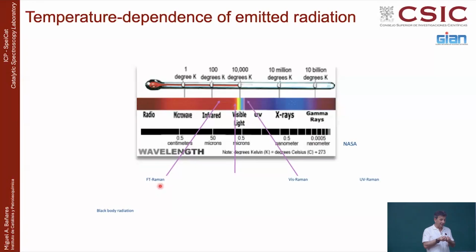And if you use a Raman infrared, the photons that are coming out with Raman signal will be photons with the energy of this infrared laser and a little bit less. So they will be infrared. But if the sample is hot, it will be emitting infrared. Sample at 100 degrees, you already know that the sample is hot at 100 degrees before you touch it. Because when you get near, oh, heat is coming from here. So you are feeling the heat.